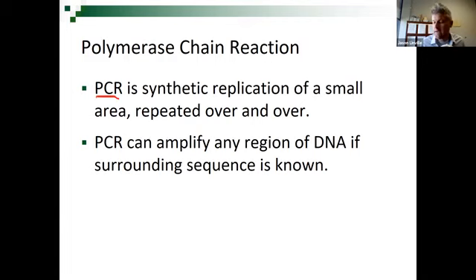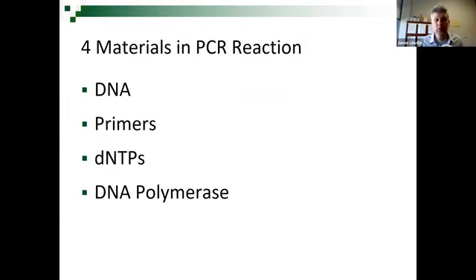But with PCR, it's not as though you can just throw DNA in a tube and run PCR. You need to know a little bit about the DNA you're trying to amplify. Lucky for us, we're trying to amplify human DNA, and we know a lot about the human genome.